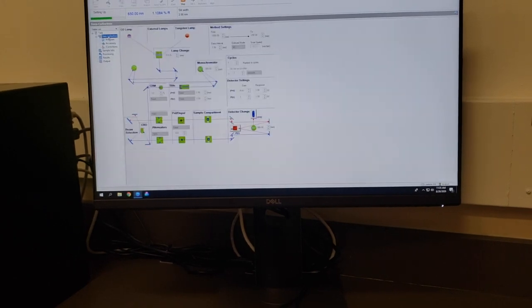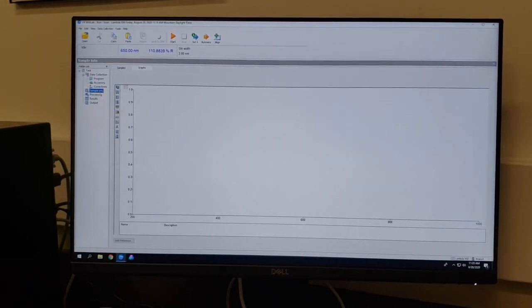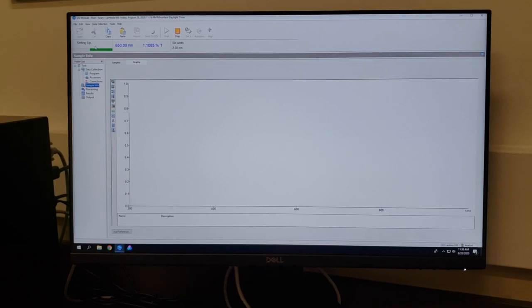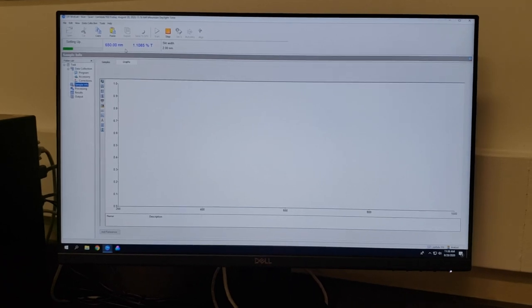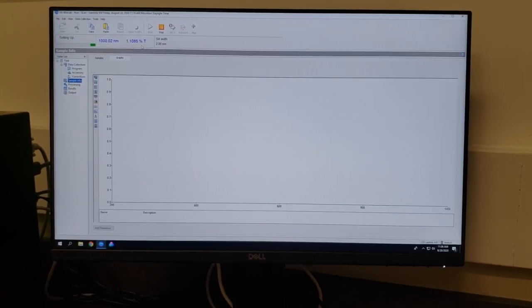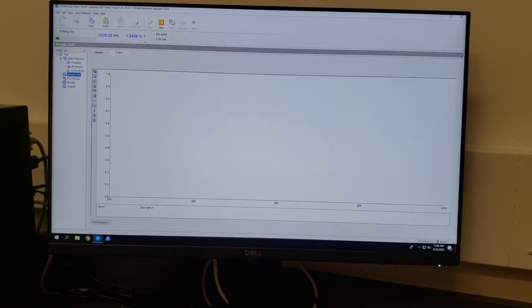I accidentally had it set to percent reflectance mode, and my sample is absolutely not set up that way, so I changed it to transmission. Clicking Start, you can watch the status in the top left corner. The instrument will begin setting up — you'll hear the monochromator rotating to start at the 1000 nanometers I requested. It is going to perform an auto zero: both the auto 100% and the auto 0% transmittance, on its own.